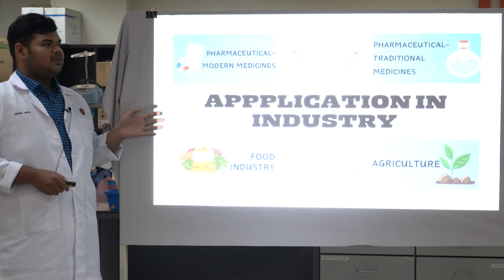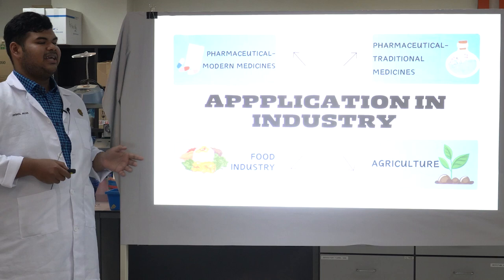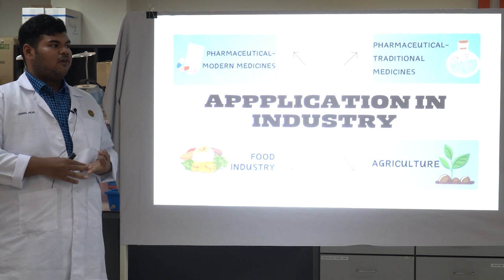In this application, TLC will tell us the chemical compounds in that traditional medicine. With TLC, we could know the active compound and the chemical composition, and we will also learn the metabolic rates of the plants in their desired condition.